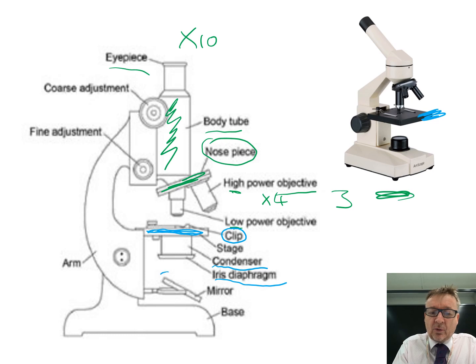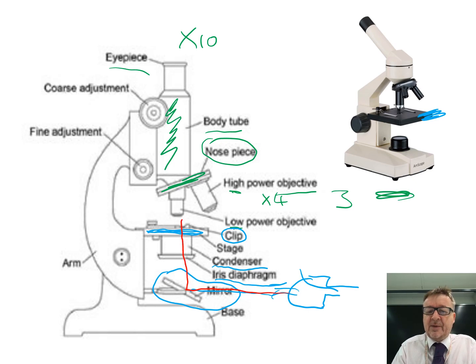This is an older microscope with a mirror at the bottom. It used to shine light from a bulb, which would hit the mirror and then travel up into the microscope. Alternatively, you could position it next to a window so that light from the window hits the mirror and goes up.